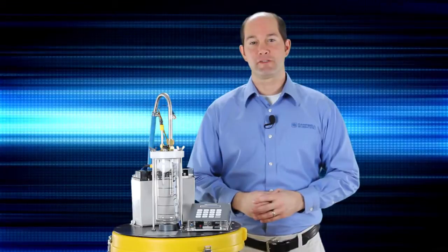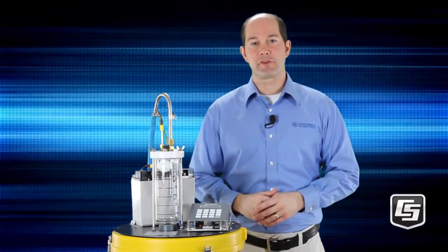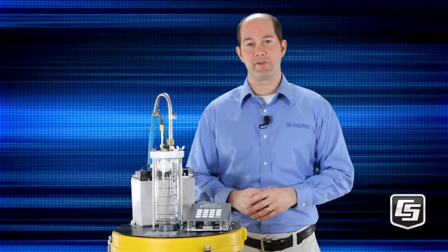Hello and welcome to part one of a multi-part series on Campbell Scientific's water samplers for stormwater, wastewater, or other water quality applications. Our samplers use external vacuum pumps to draw water through intake tubing instead of the traditional peristaltic pumps that induce flow by squeezing flexible tubing.